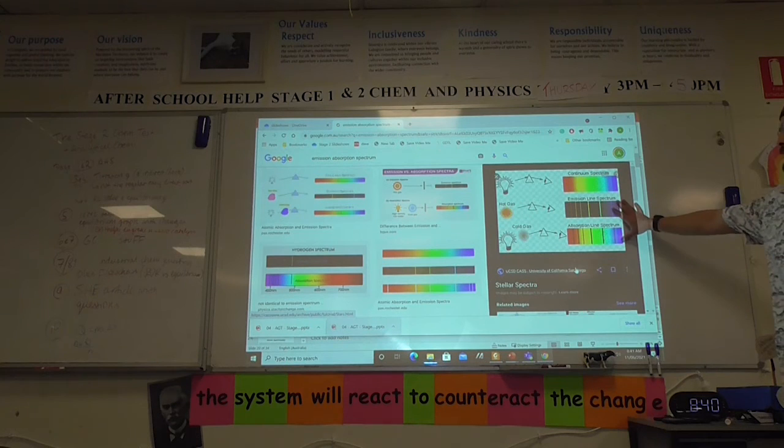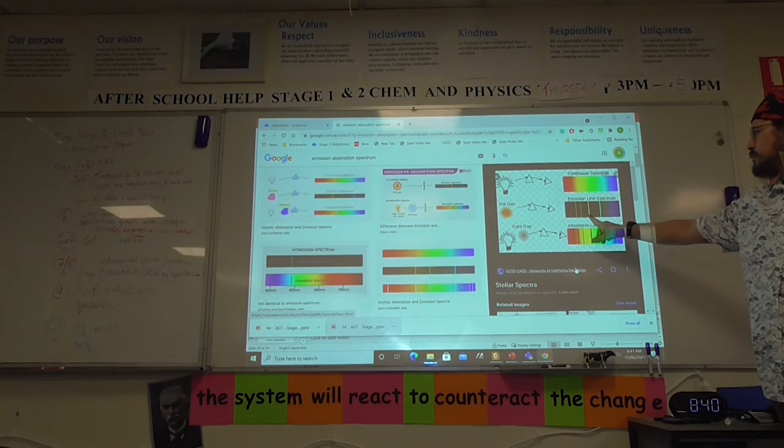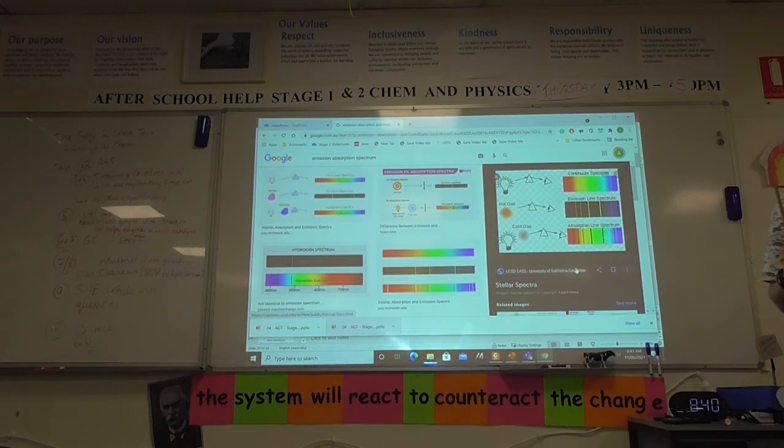This is the two we're interested in. When you heat up a gas or pass electricity through it or provide energy to it, you get these lines, special colours, which relate only to the rungs of the element for that special spectral fingerprint of that element.